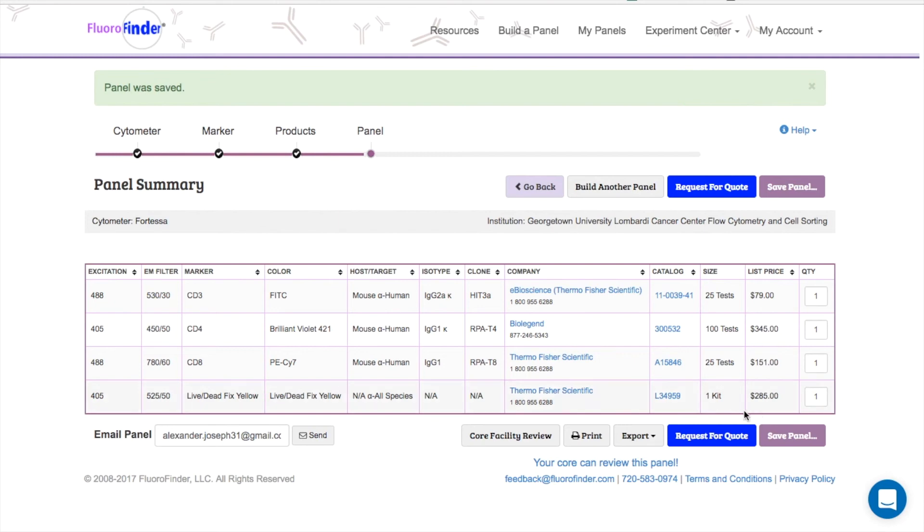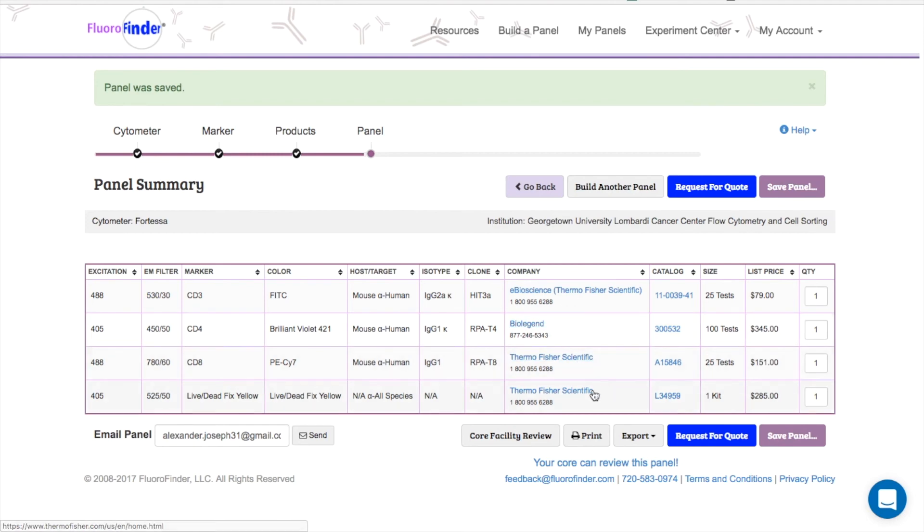You can easily request a quote using this blue button. This will reach out to the vendors that provide your selected products and request discounted pricing that takes into account your specific institution or affiliation.